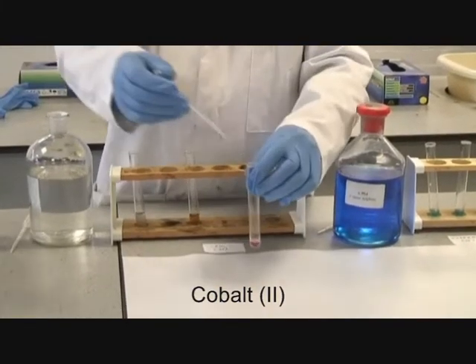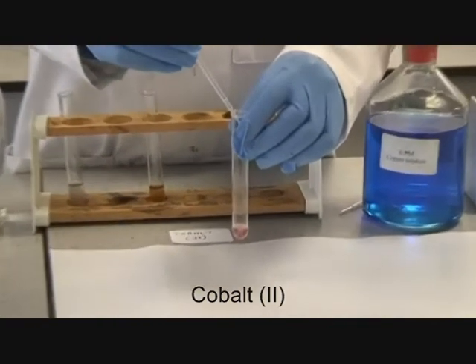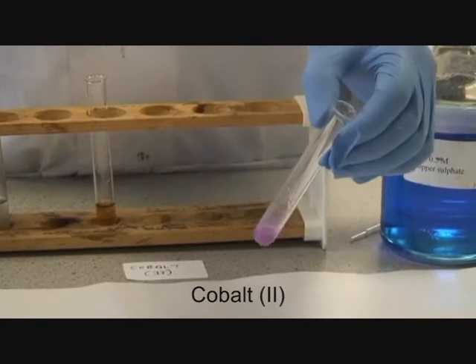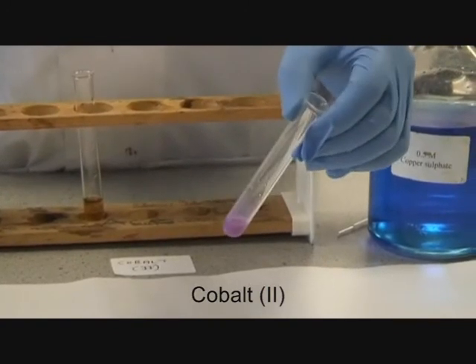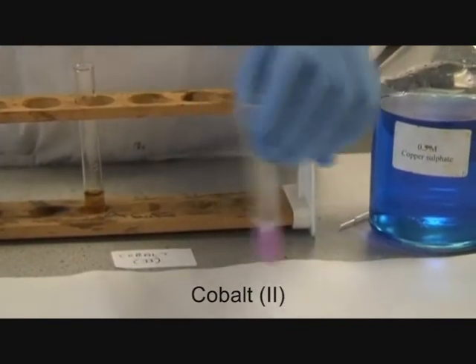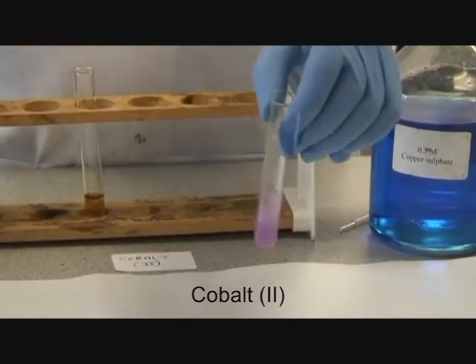Using carbonate ions with cobalt-2, you get a mauve pink precipitate. On addition of excess, the change is noted.